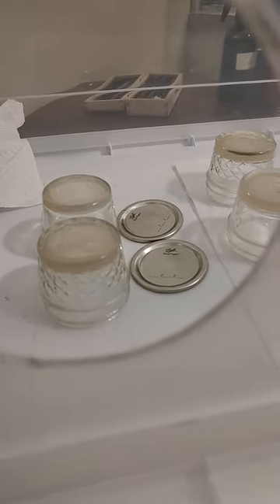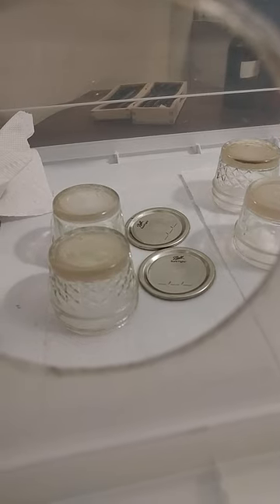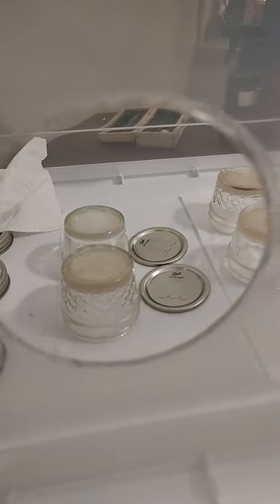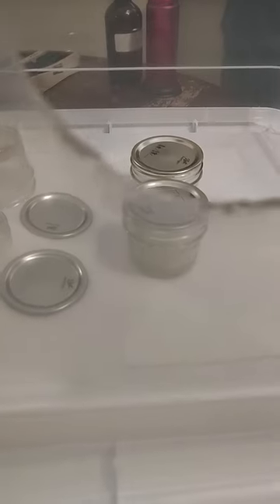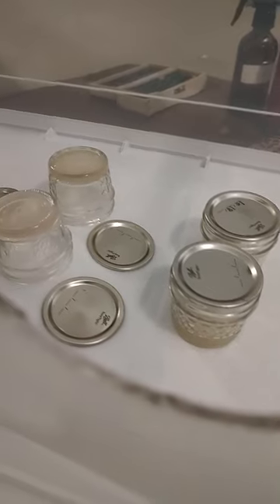The paper towels where we have everything flipped upside down are soaked in 91% alcohol. Of course we'll be wearing gloves. Just wanted to show you what this looks like — these are our clones and we're going to be doing a transfer.